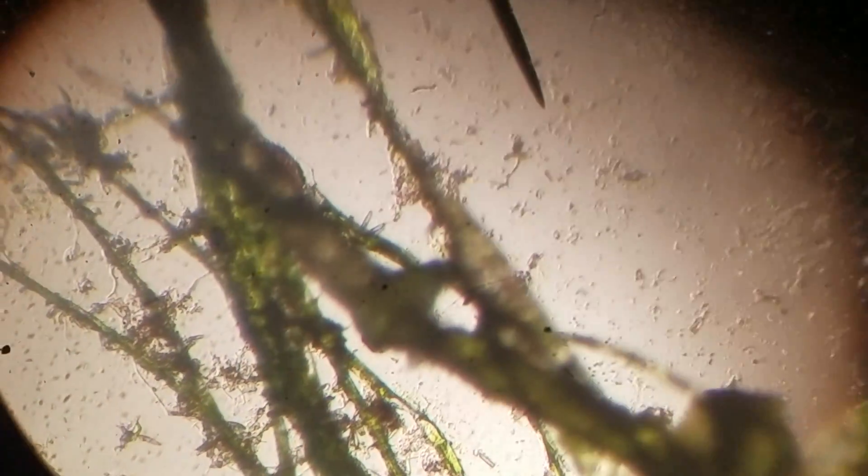There are single-cell things in clumps, and there is a little bit of fur. That fur is actually how this algae reproduces — it still has the green chlorophyll in it, just as any photosynthesizing organism will. It will break off at these hub points, and when it splits off from these hubs it can start a new bacteria colony. You can see little chunks in the lower left that are fuzzy clumps — those are rhizomes. They basically work like a fern would: they send out runners and grow from there.